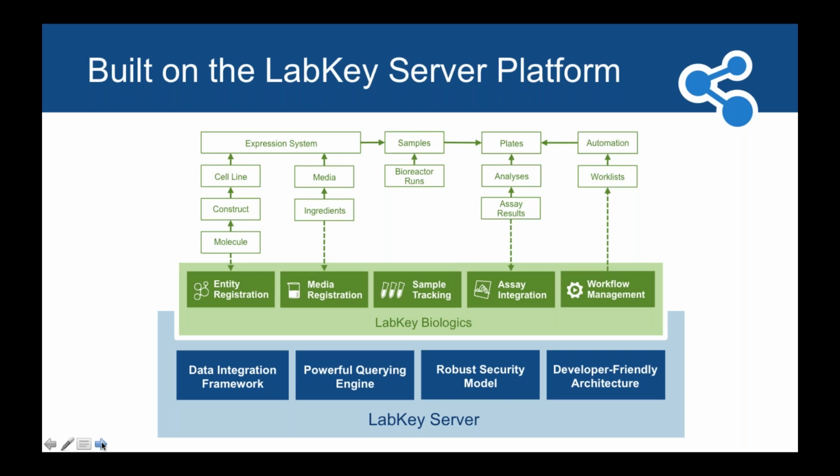into an institution. It's important, however, to have a powerful querying engine that allows us to connect those types of data. And one of the key aspects of the LabKey Biologics piece was not only being able to query, but query in a performant manner to be able to get those answers back quickly. We have a robust security model, which means that there is permissioning and roles available for all the various individuals that are using LabKey Server, and then ultimately a developer-friendly architecture. So people can build their own modules, and use the existing APIs that we use in the application itself to build additional functionality that we may not have developed quite yet.